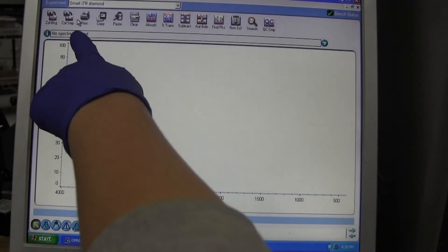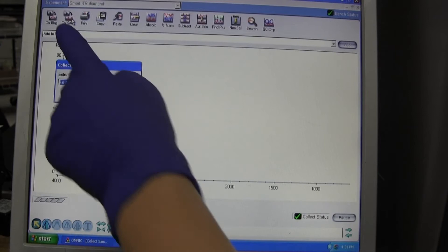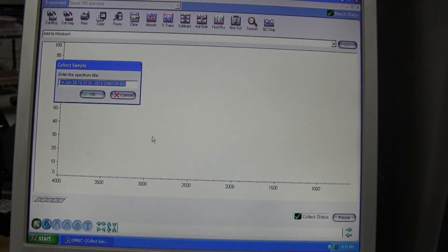Next, you will collect your sample. Select the Collect Data button from the menu at the top of the screen. Then, input a file name. This should include your initials, lab day, and the title of the lab. For example, I might title mine ADKTPMPIR: initials, day, time, and title.